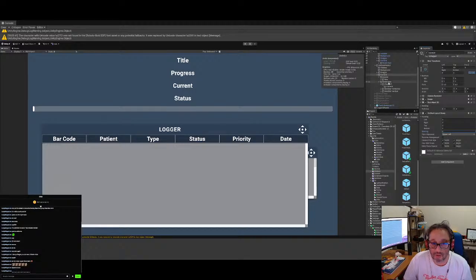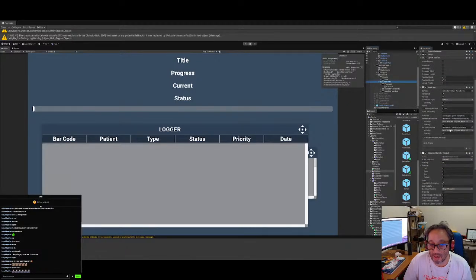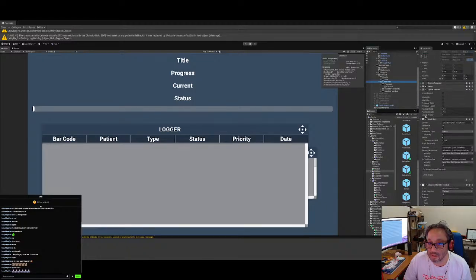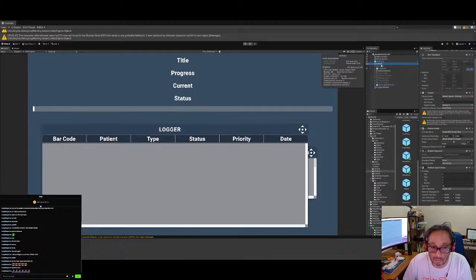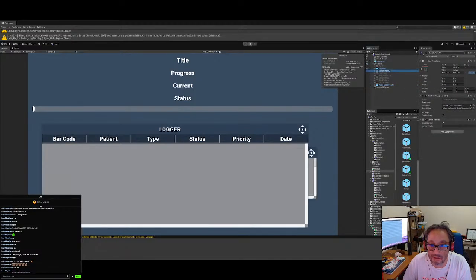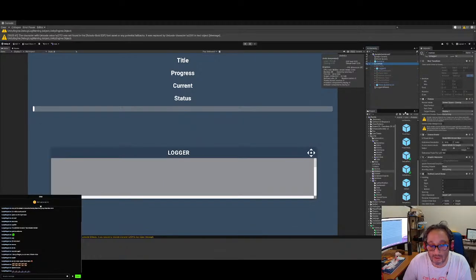And so we go to scroll view here. Like I said, we are leveraging several plugins. One is Enhanced Scroller, and the other one is the table layout. So let's start from the beginning, and then we can finish off with a bang.